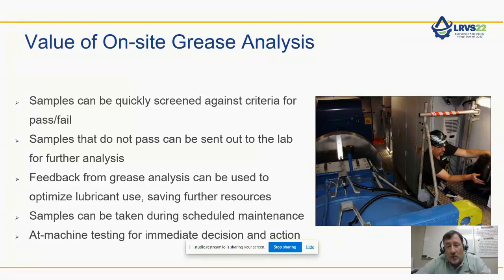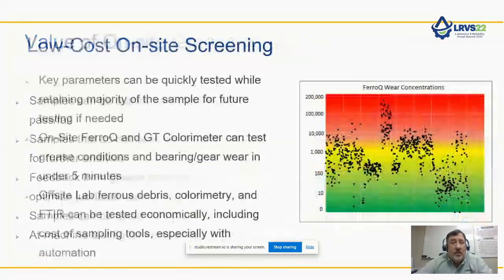Samples can be taken during scheduled maintenance, or in some cases while the equipment's running, and that immediate decision and action can be vital for some applications.